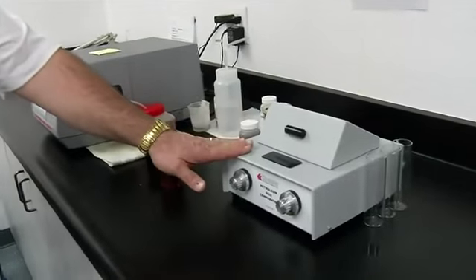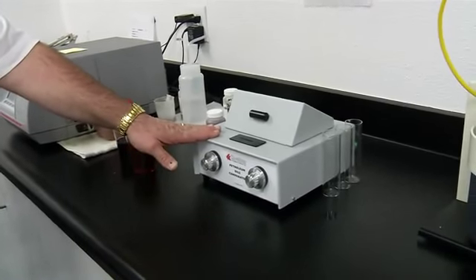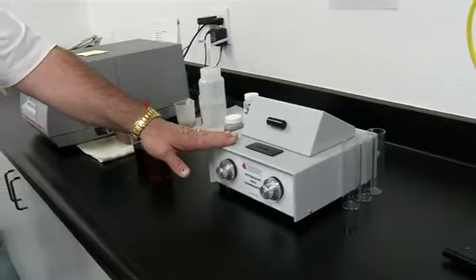And these are a few other pieces of instruments that we have. One is a colorimeter. This basically is used as a quality assurance tool. It's to make sure that the product that's on the shelf consistently has the same color between batches. That's very important because if the customer buys one product today and buys another product 2 months from now, they want to make sure it's the same color. So it's more of just an aesthetics issue.